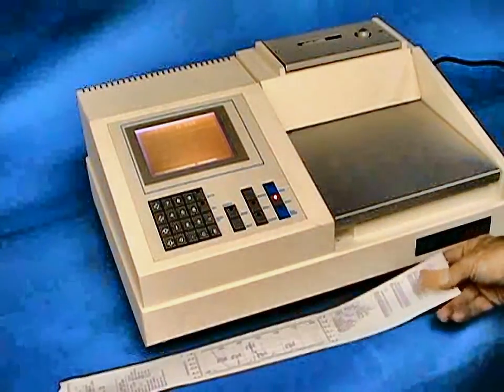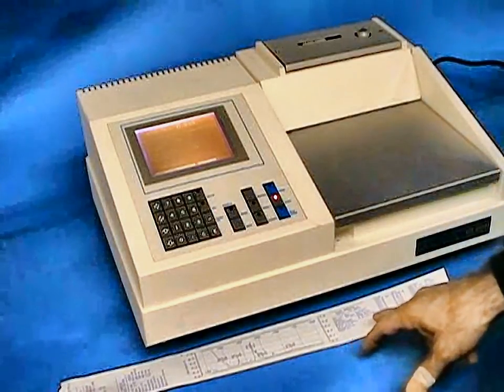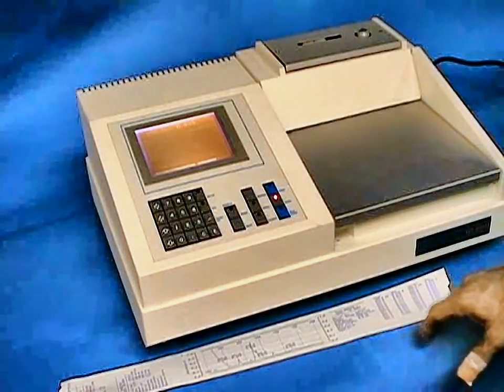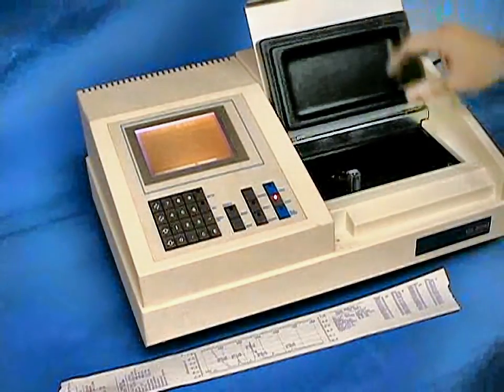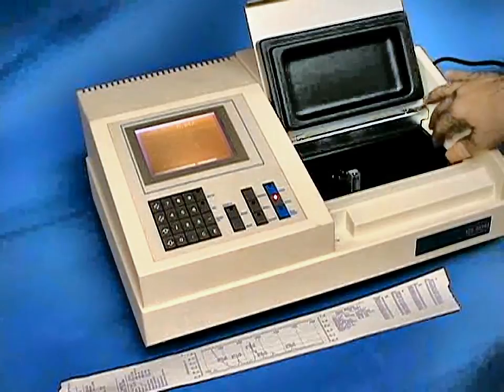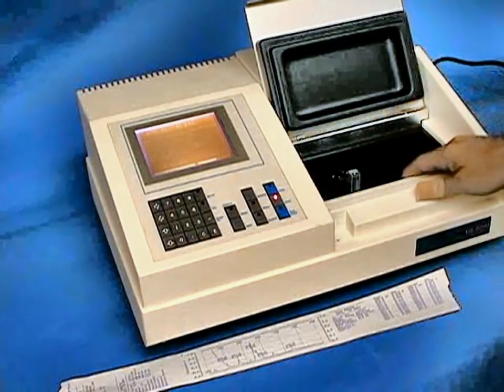The printout will show you the spectral data, identification of the date and time for the sample run, and your peak and valley positions. The sample chambers on the CECIL series of spectrophotometers are capable of adapting to cell changers, sippers, and batch samplers as well.